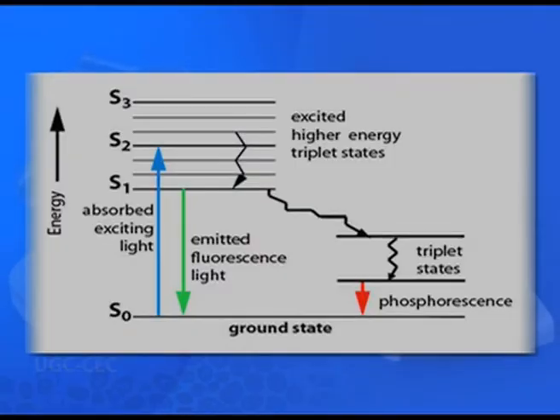Now let's talk about another form of microscopy, that is fluorescence microscopy. But before we jump to fluorescence microscopy, first let's understand what fluorescence is. Fluorescence is the property of some atoms and molecules to absorb light at a particular wavelength and to subsequently emit light of longer wavelength after a brief interval termed the fluorescent lifetime. Fluorescence microscopy explores this fluorescence property of certain chemicals to develop far better resolution and contrast compared to light microscopy.